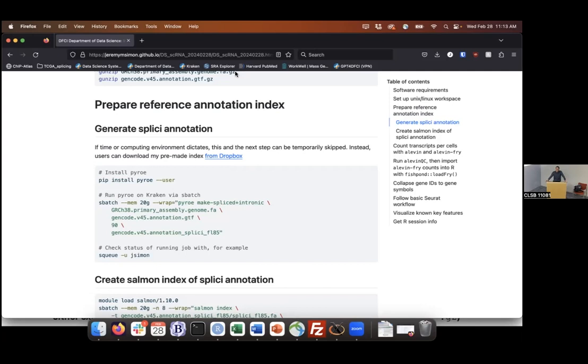But if it's a 90 base pair read, then I'm not sure how often that happens, but there's going to be cases that are definitely a mixture of those 3 buckets, basically, that are enough to affect the conclusion. Right, and the poly A selection isn't 100%, and so there's going to be some random events that happen.